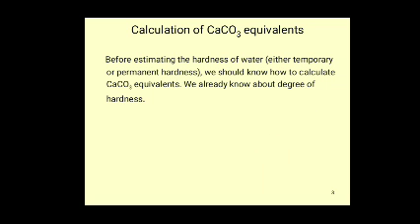Calculation of calcium carbonate equivalence. Before estimating the hardness of water, either temporary or permanent, we should know how to calculate CaCO3 equivalence.